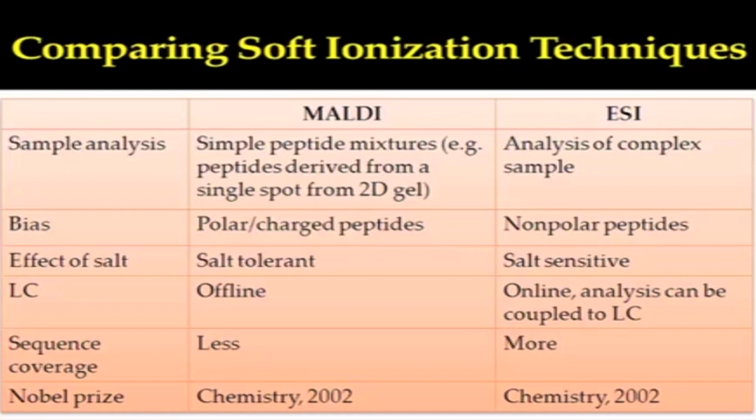For proteomic applications, the sequence coverage is less in MALDI as compared to electrospray ionization. Both MALDI and ESI developments were awarded the Nobel Prize.